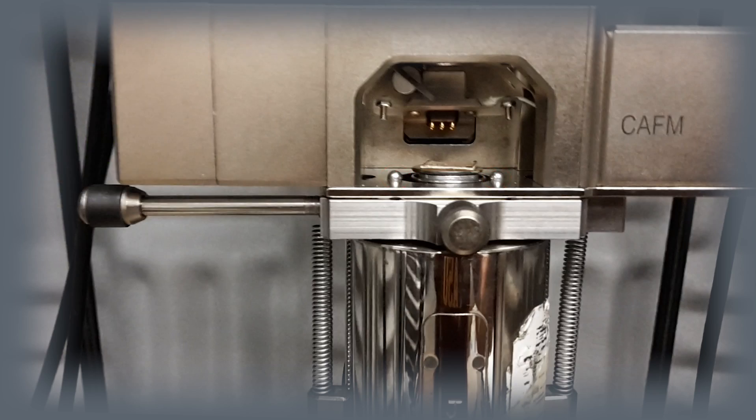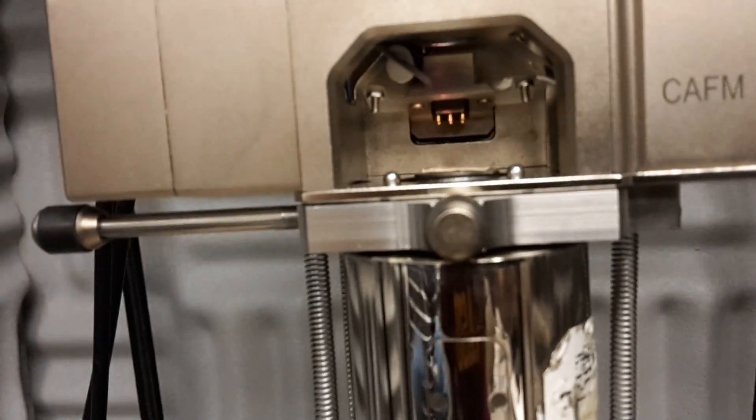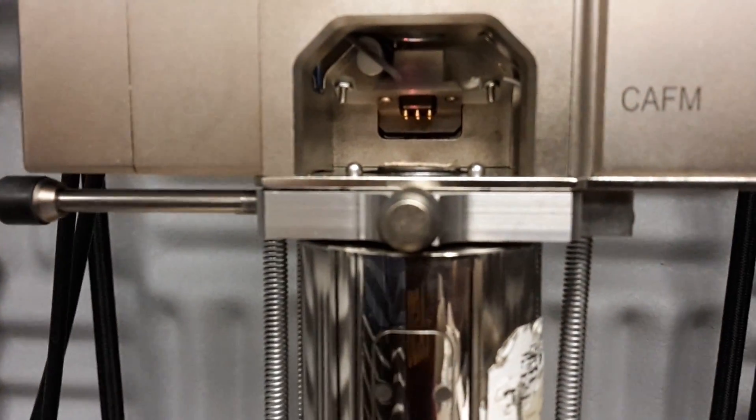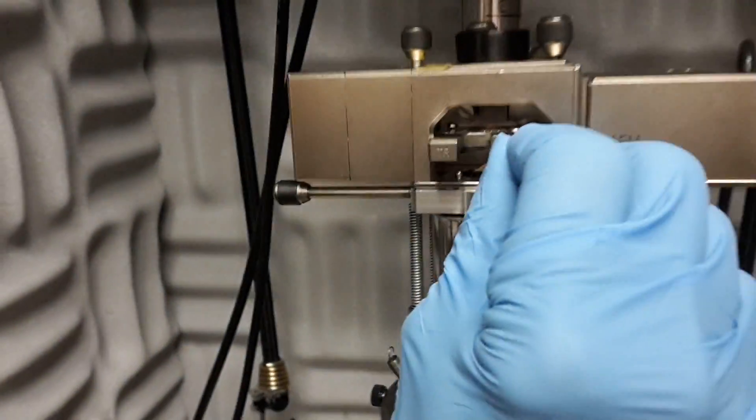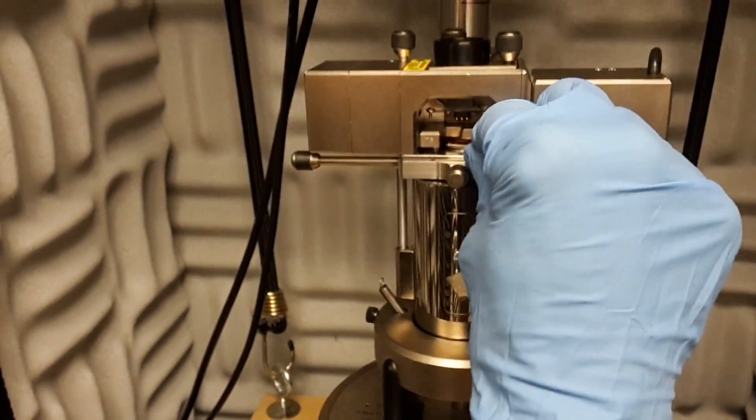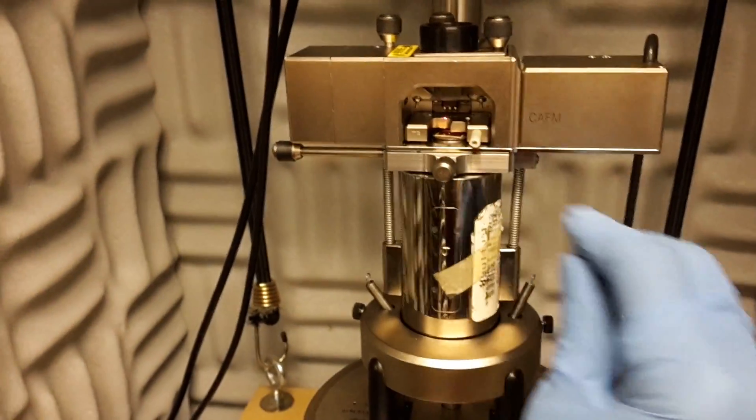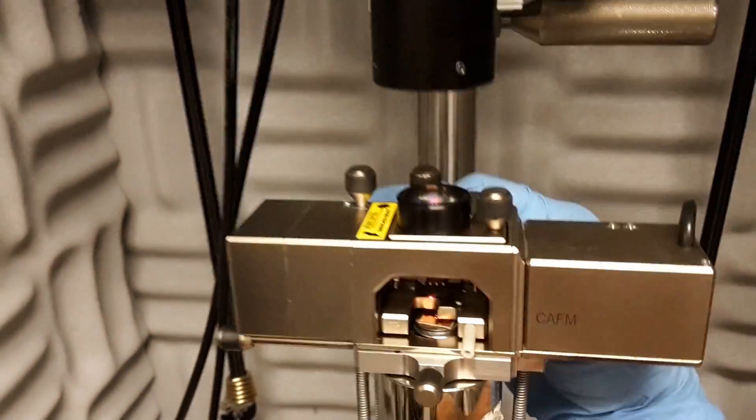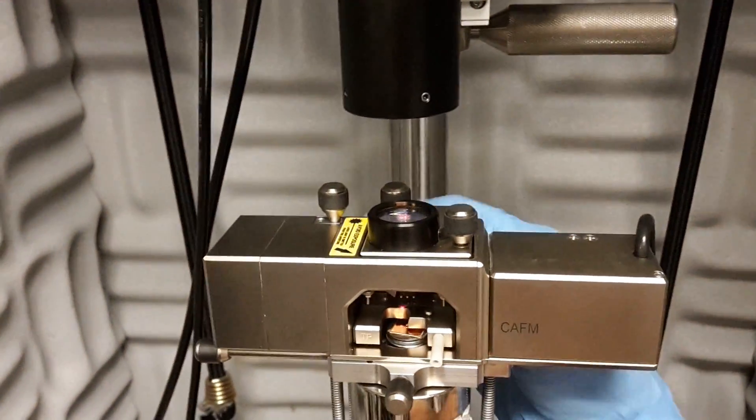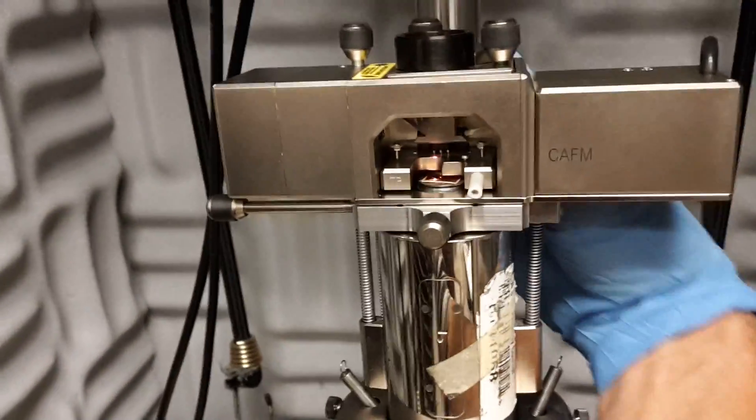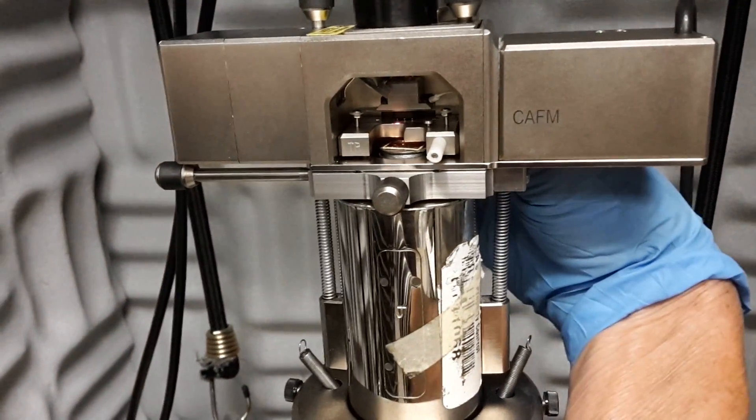Carefully insert the probe holder, placing it to the back of the optical head, allowing it to sit freely on the positioning pins. Reach around to the center knob in the rear of the optical head. Turn the knob to secure the probe holder. Do not over tighten.